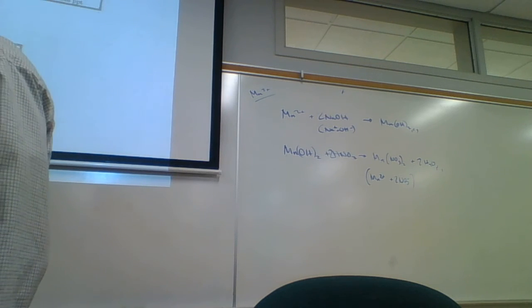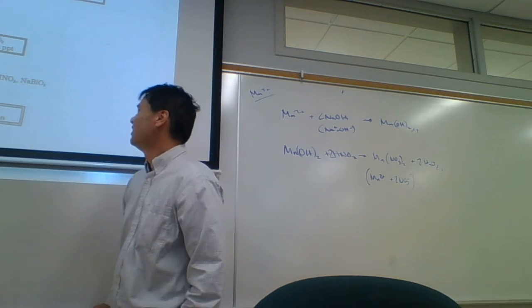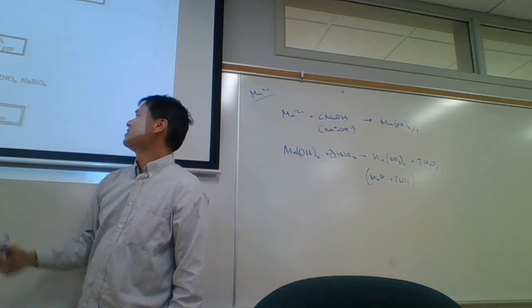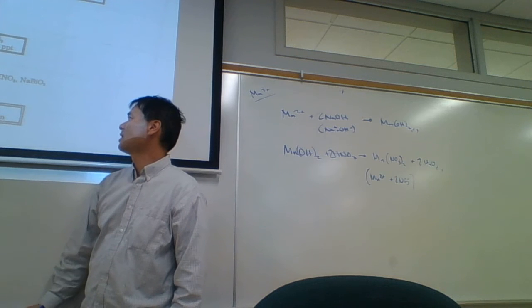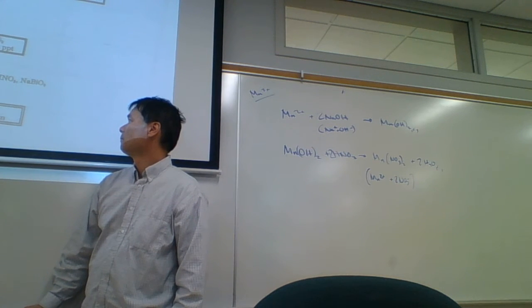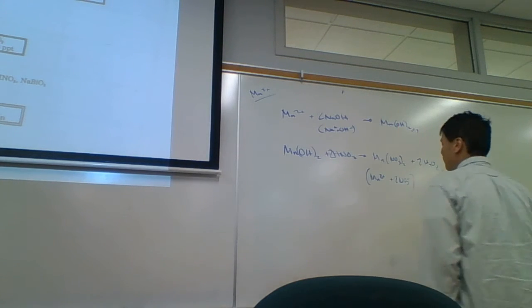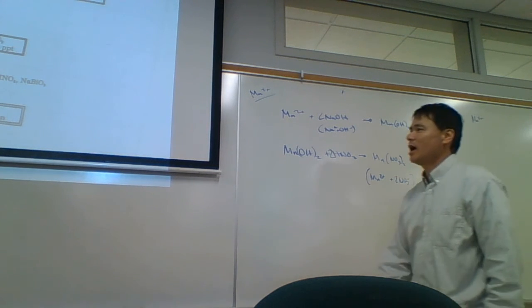Yeah, because there's 2 parts to this. The first part's the known, the second part's the unknown. And so why do we need such a powerful oxidizer? This stuff is fine if you're just careful with it. We need it to take some electrons from manganese. And so what we're going to do is oxidize manganese.